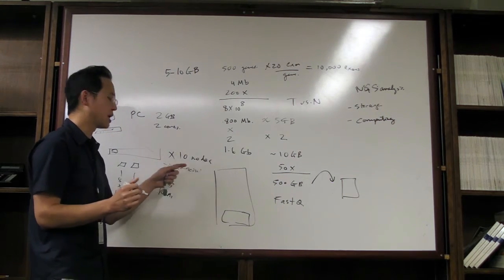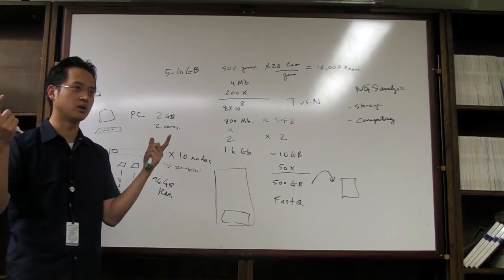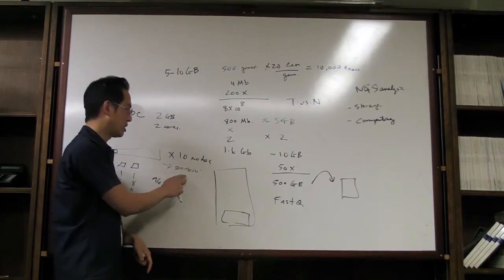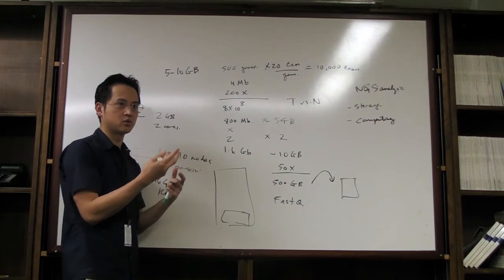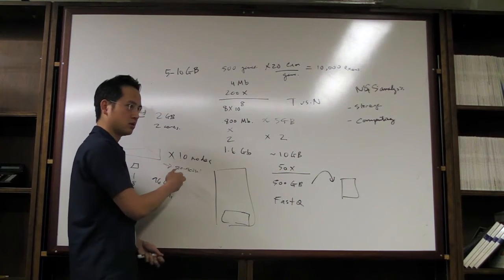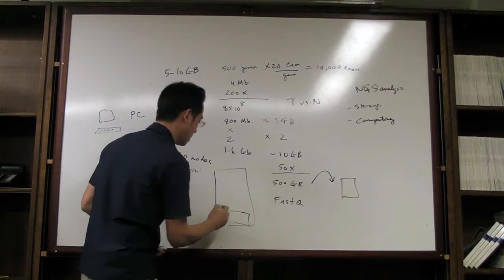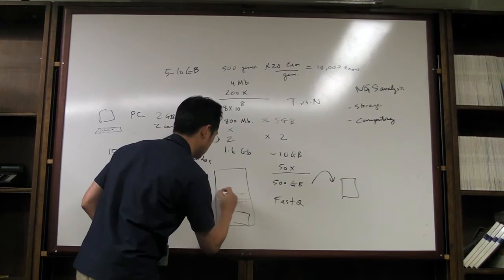So it's like running 10 blow dryers. You can imagine if you ran a blow dryer and just a toaster at home, right? That's 2 of these, but you have to run 10 of them, and it will trip your circuit on regular circuitry. That's why you need hefty power at the bottom, and then you just have stacks and stacks of this.